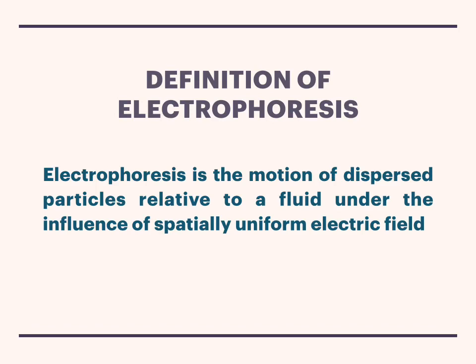That is, when you apply an electric field in a medium such as a liquid, you apply it by two electrodes. The positive electrode is known as the anode and the negative electrode is known as the cathode. When this electric field is applied over these electrodes, the negatively charged anions migrate towards the anode and positively charged cations migrate towards the cathode. This phenomenon is known as electrophoresis.